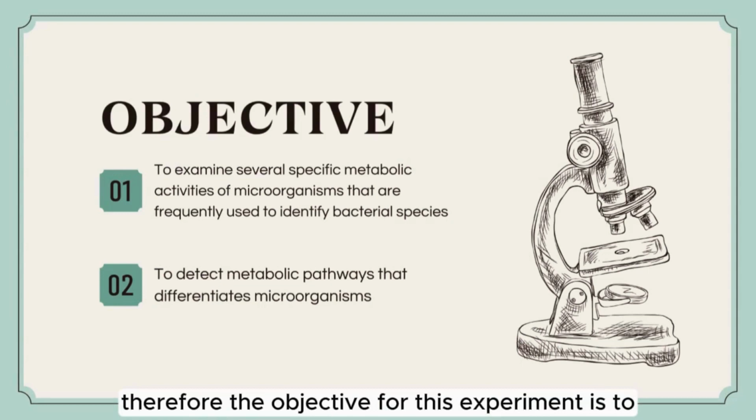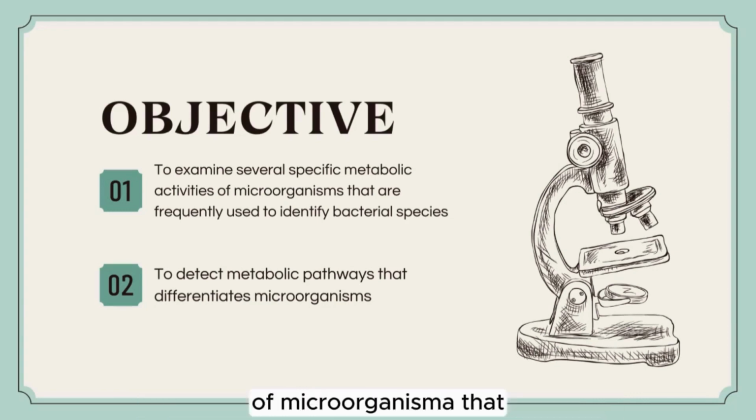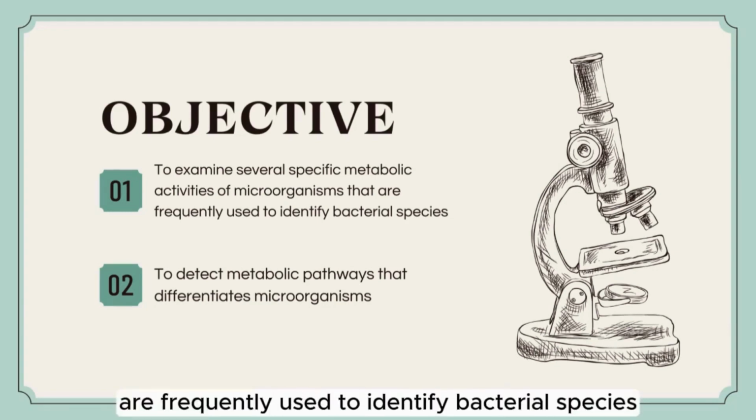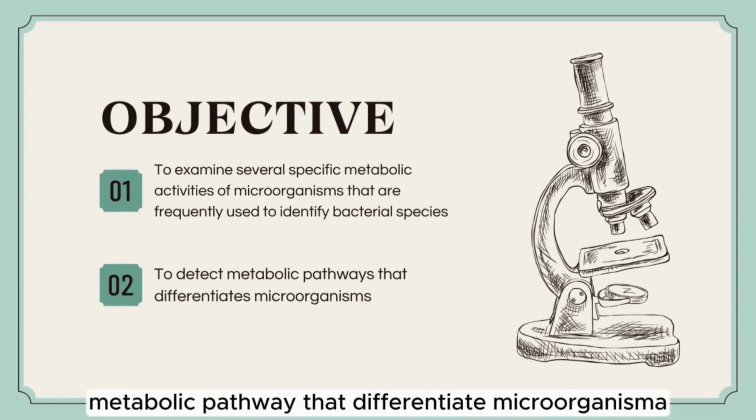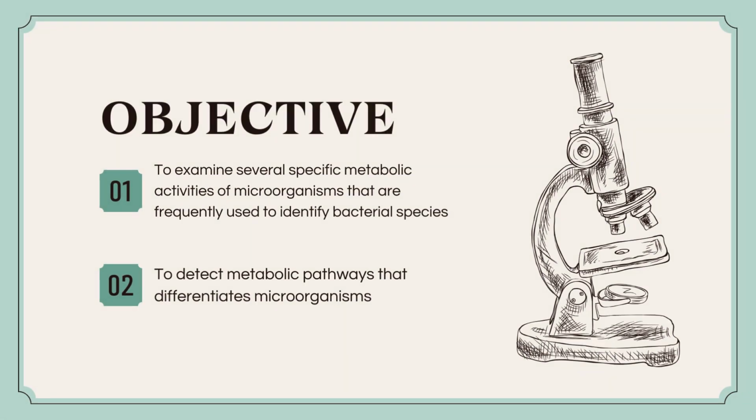Therefore, the objective for this experiment is to examine several specific metabolic activities of microorganisms that are frequently used to identify bacteria species, and the second one is to detect metabolic pathways that differentiate microorganisms from this experiment.